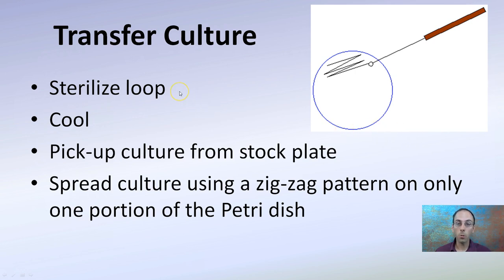To transfer the culture, you want to sterilize the loop as shown previously. Let it cool — you don't want to go directly from the hot flame to the culture because you'll burn and kill them all. Then after it cools, you want to pick up the culture from the stock plate. Spread the culture using a zigzag pattern on only one portion of the petri dish. That back and forth motion will allow, through friction, cultures to be transferred to the media on the petri dish.